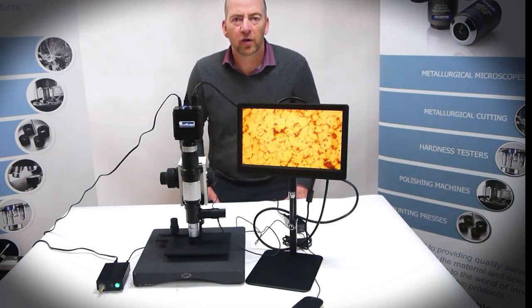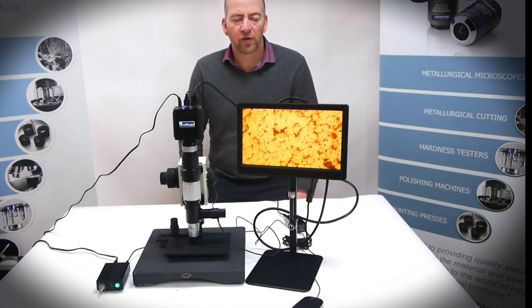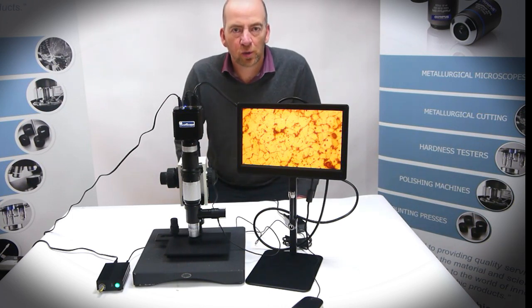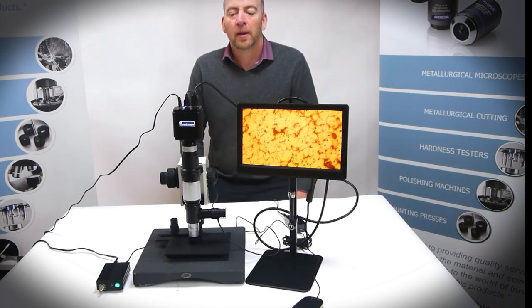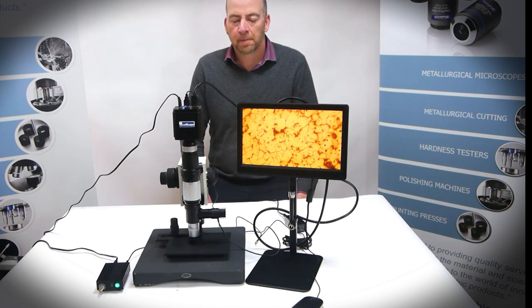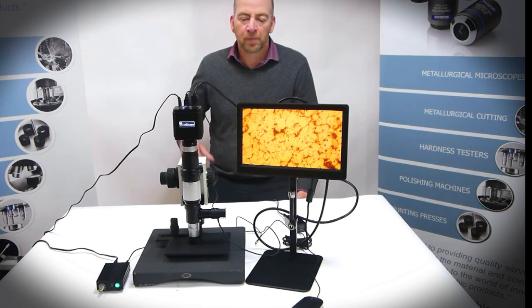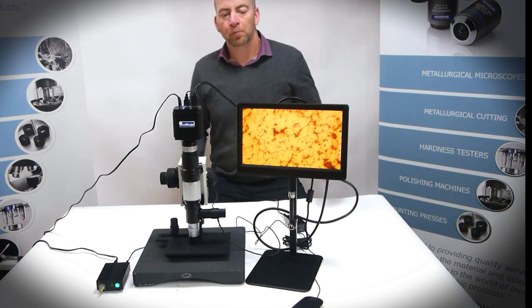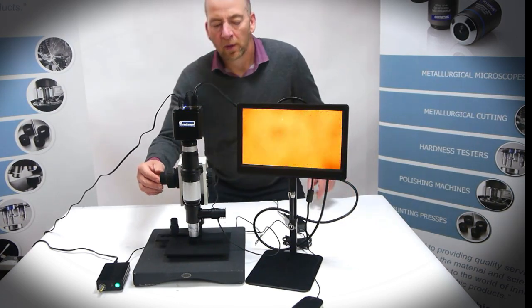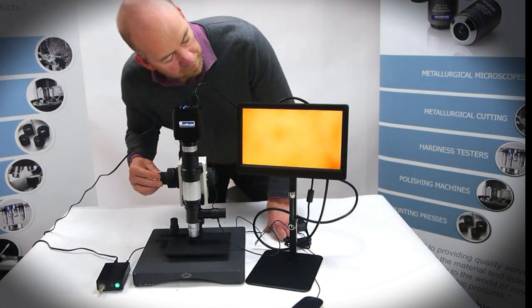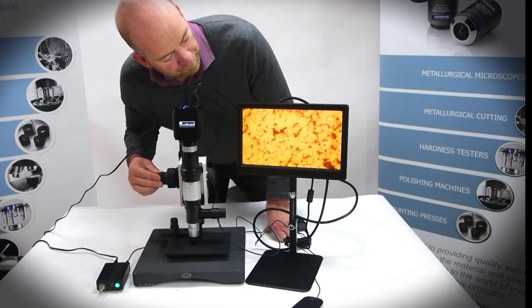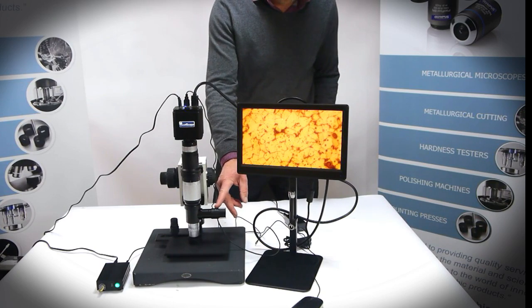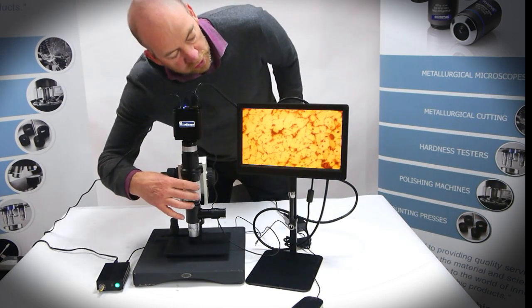Here we have our digital microscope, offering fine focus and coarse focus illumination and zoom optics — a configuration for high magnification observation using a digital microscope system.